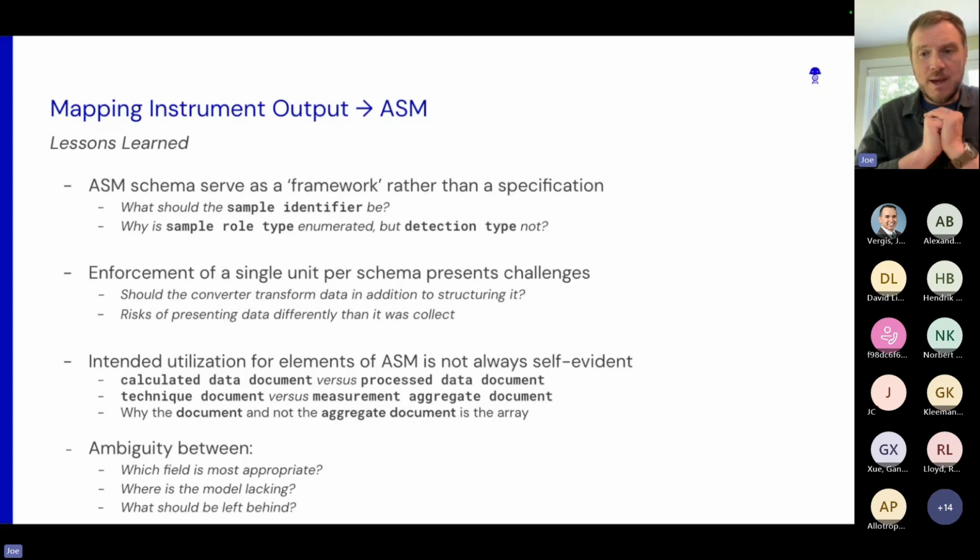Also, if you are using this to structure data that is then immediately returned to users, you run the risk of showing the data in a different format than they collected it in. Even for something as simple as changing from nanograms to milligrams, is it better to keep it as it was reported, especially since the model doesn't provide a means to record what it was originally reported in?